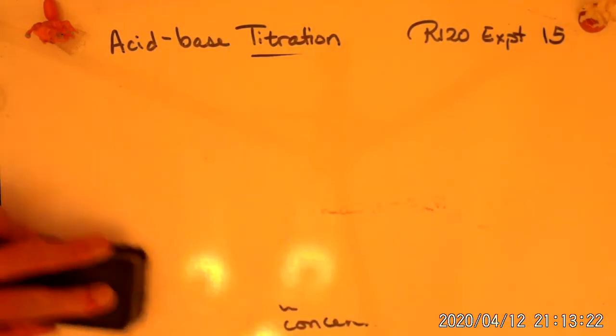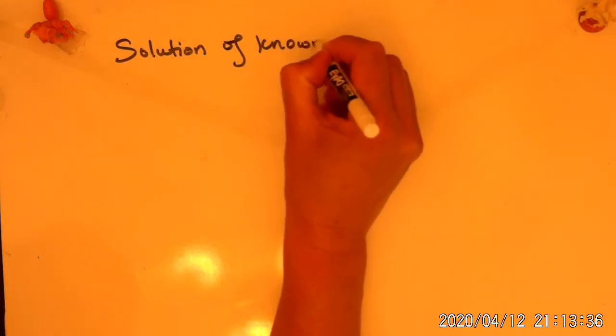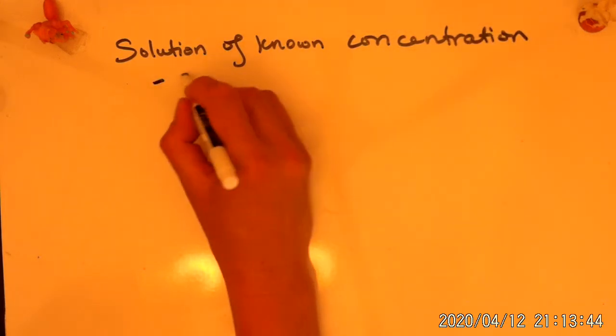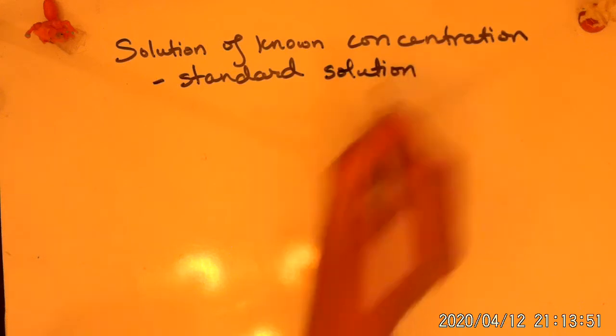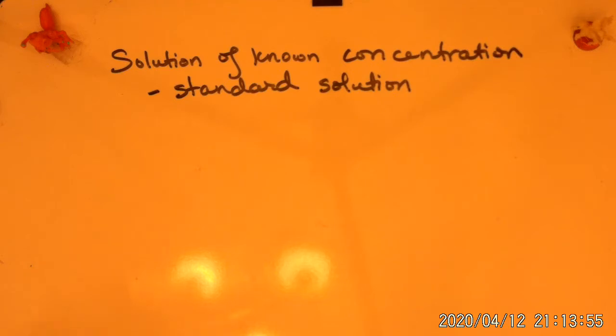Okay, so let me erase this and let's talk about some terms along the way. What are some of the terms? When we have a solution of known concentration, this is our standard solution. Okay? Alright, so just so you know, we need to develop our standard.